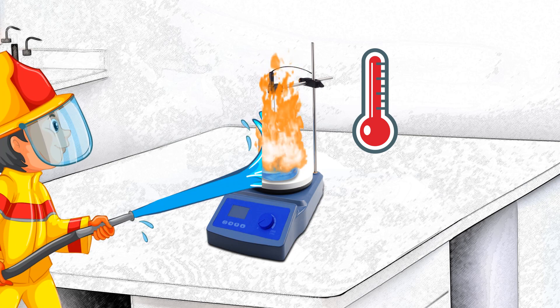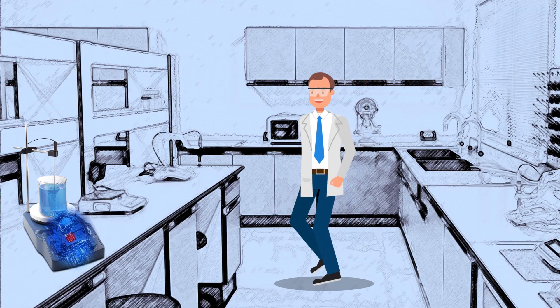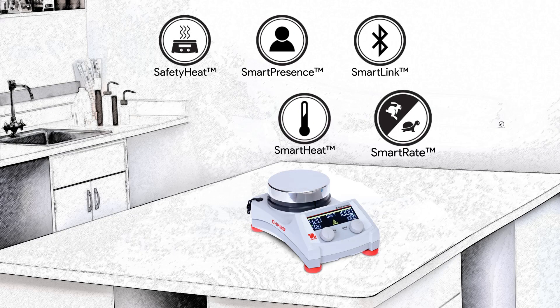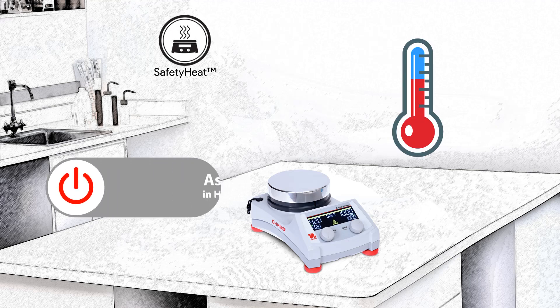When selecting laboratory equipment, safety must always be the driving force behind any buying decision. Safeguarding lab operators is a guiding principle behind every piece of OHAUS laboratory equipment. Featuring superior safety features and intelligent performance, the Guardian Series hotplate stirrers assure lab safety with our exclusive Safety Heat.